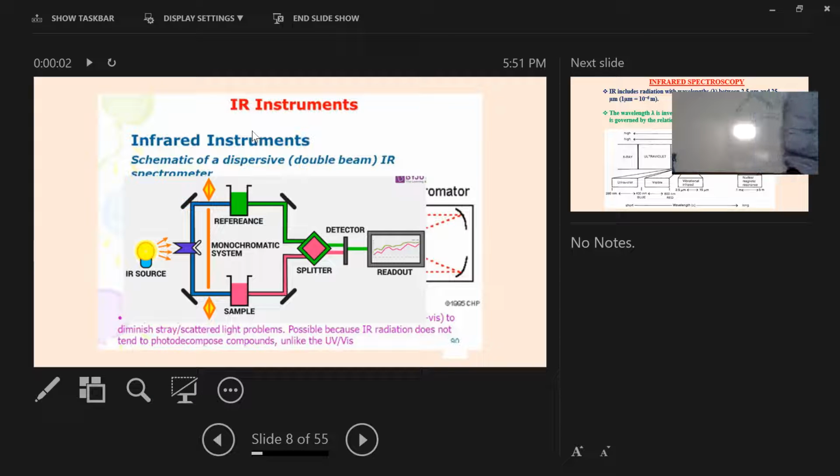Now, if you have this molecule, here we have some sample. So if it absorbs some light, in that case, the intensity of this light will reduce, because we are measuring the light intensity, that is, how much light is passing through. So if it absorbs something, the intensity of this light will be reduced, maybe around 15%, let us consider.